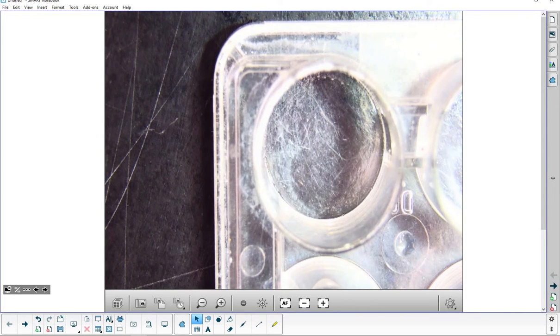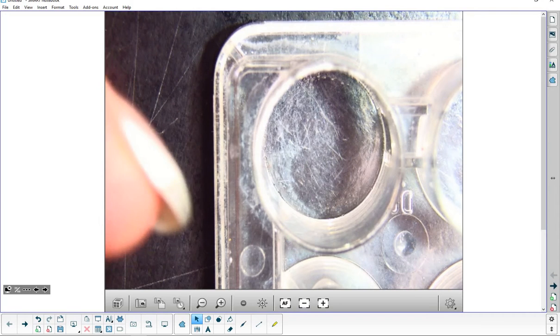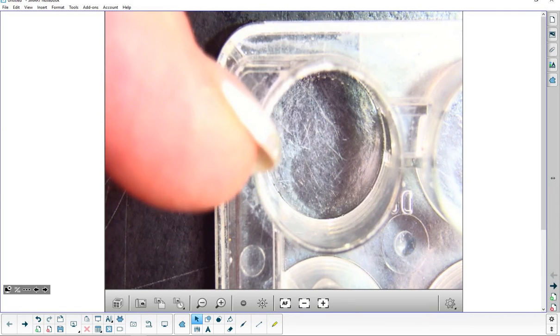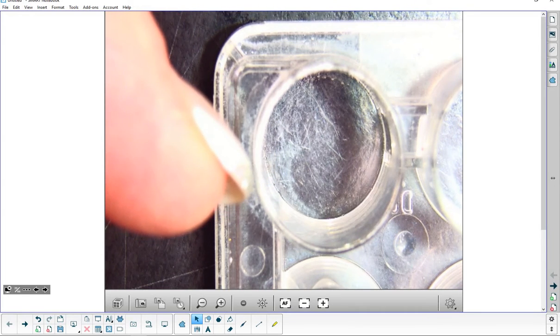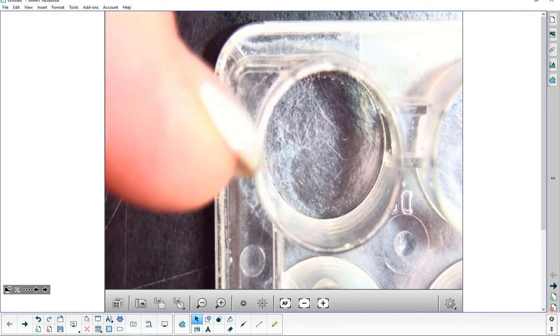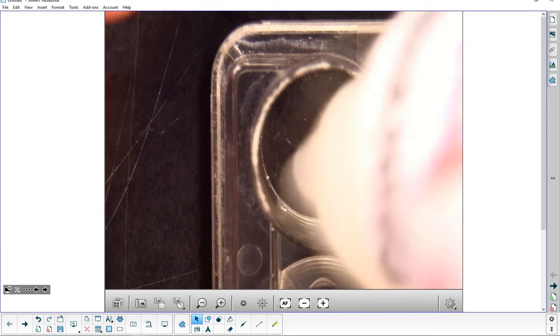You're going to need to decide how many drops you're going to want in a well. A well will hold about 30 drops nicely, so you don't want to go over 30. You also don't want to dilute the concentrated acid, because you'll have distilled water you can dilute it with, more than halfway. So whatever you use, don't dilute it more than half, because it will not work, or it'll take an awful long time.